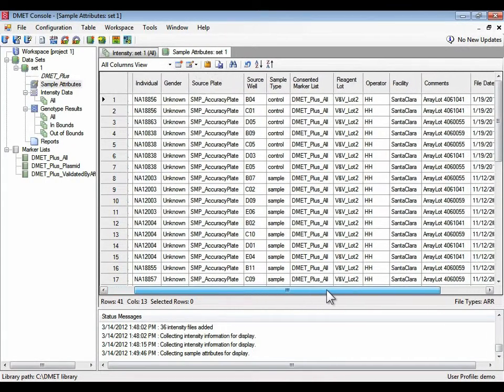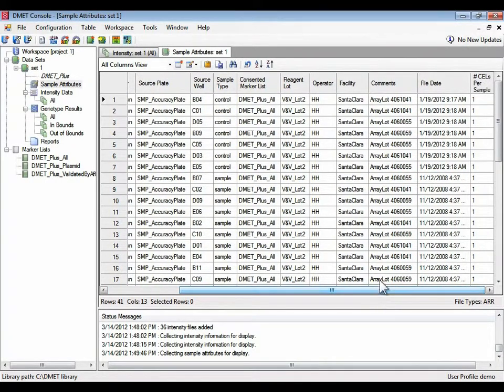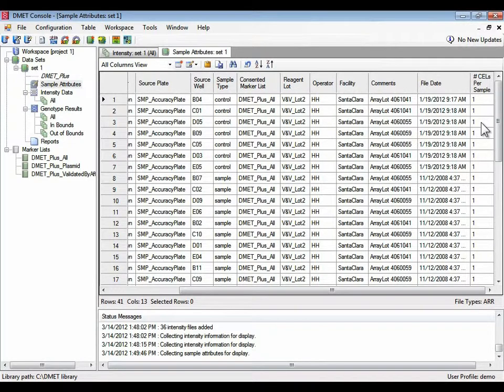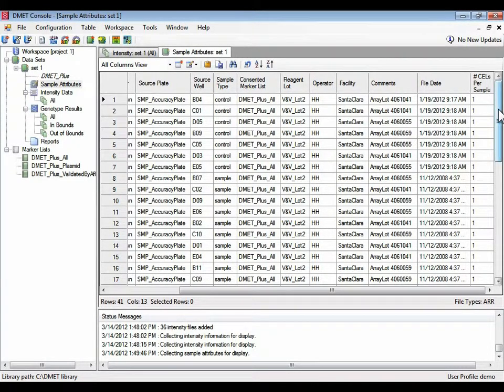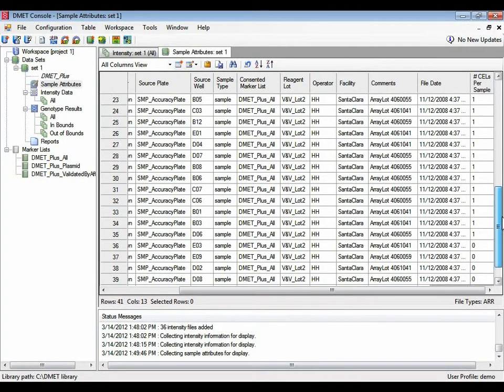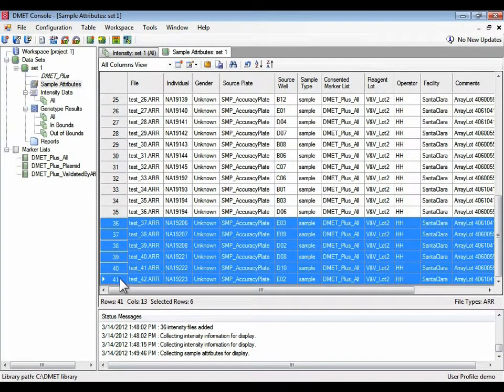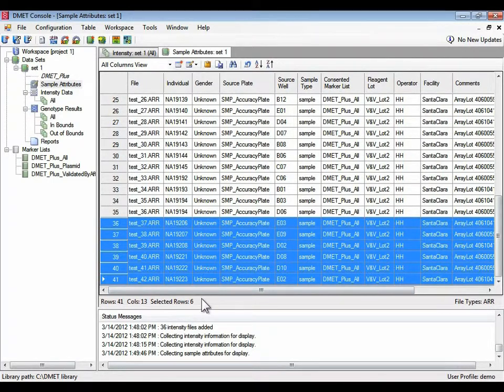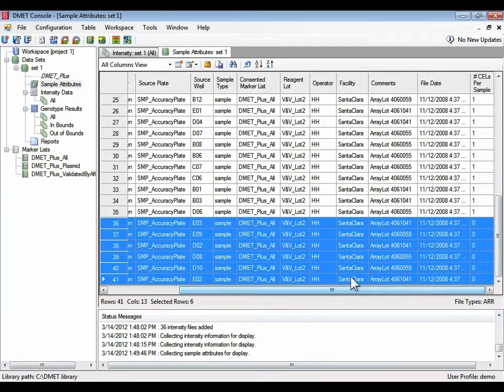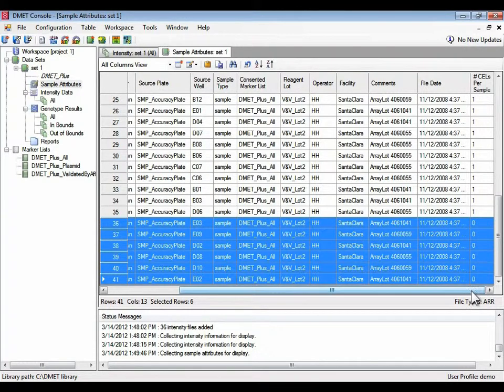It also tells you whether the associated cell file has been added to this workspace. So this is one way of detecting missing information. So for example, number of cell files per sample, as we scroll down, the last six sample files, the last six selected rows, have no associated cell files in this workspace.